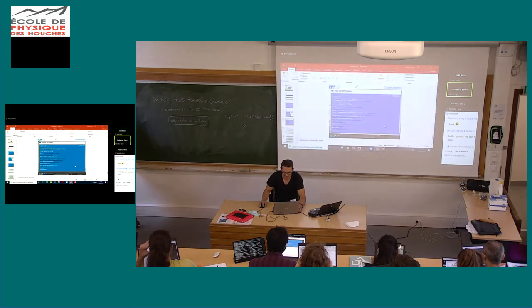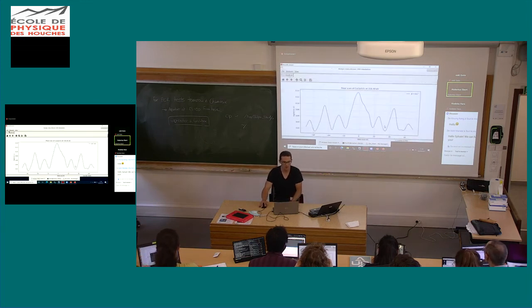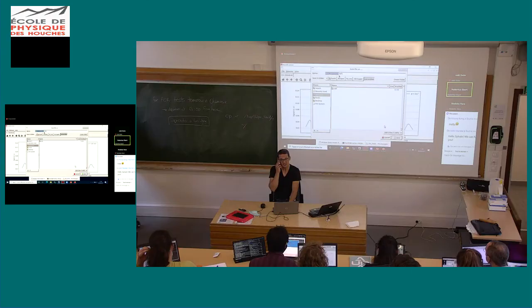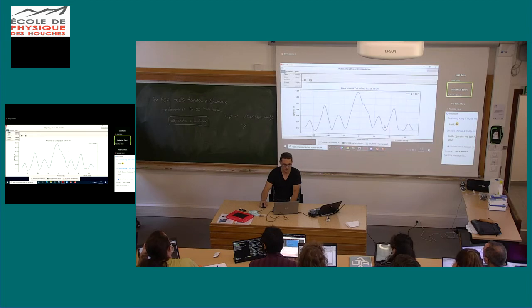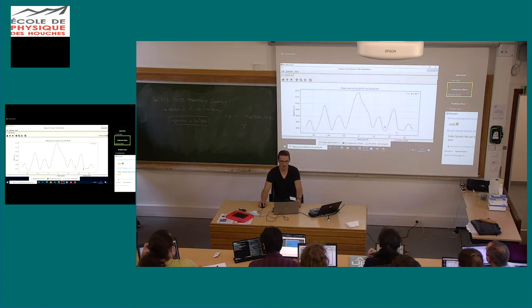So if we go back to the viewer, you can use File, Save As to save your data in HDF5 format. It's nice to retrieve your data, but it's not really easy to use as a format, though it can store a lot of data and can store everything here. But if you want, you can also export this data. You just have to click on File, Export. You create a folder, for example, results. And you go inside that folder, you open, and it will export the data.